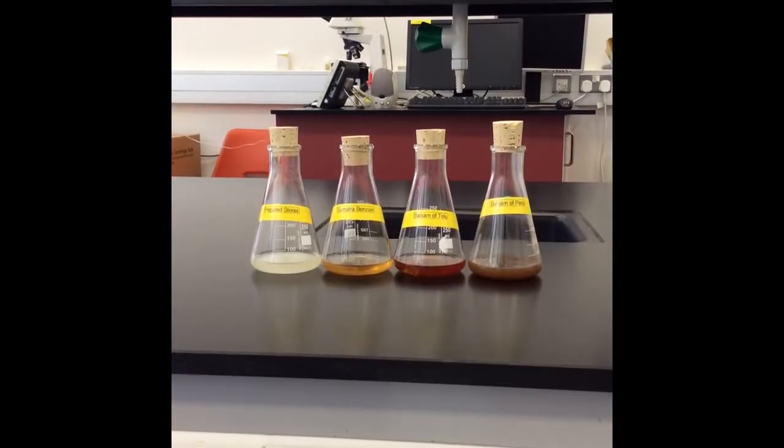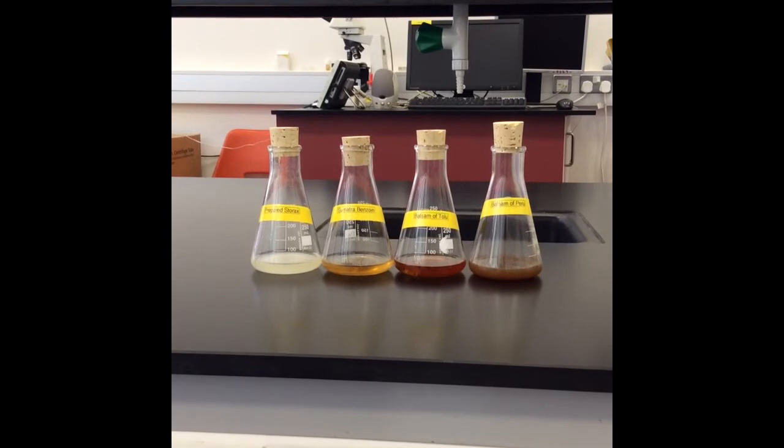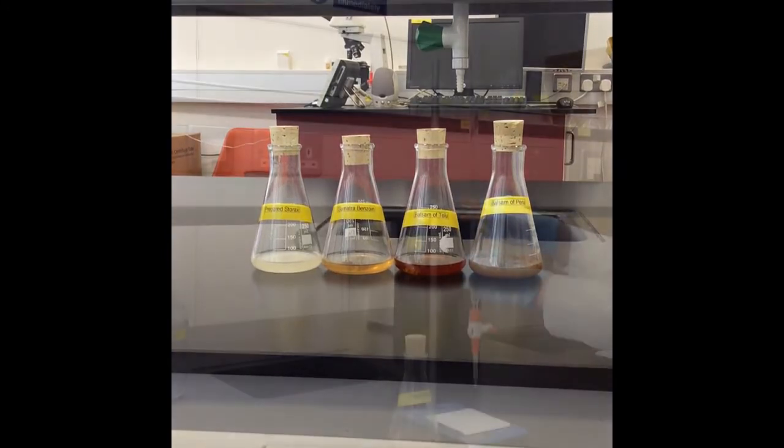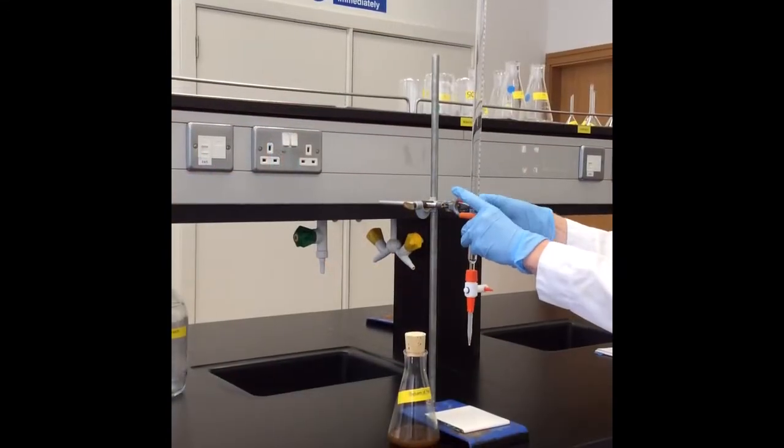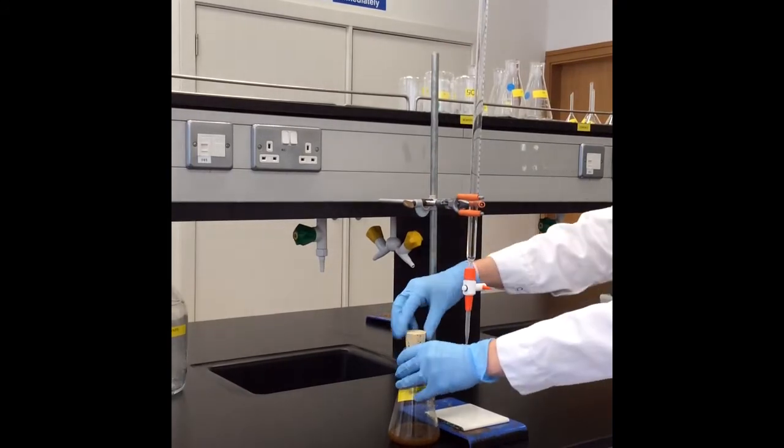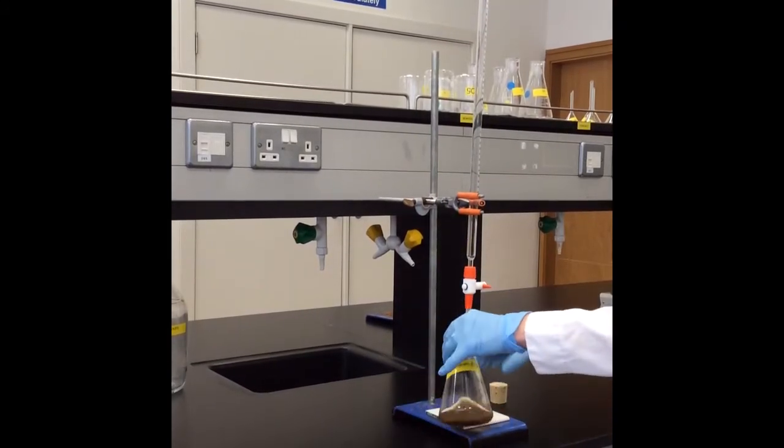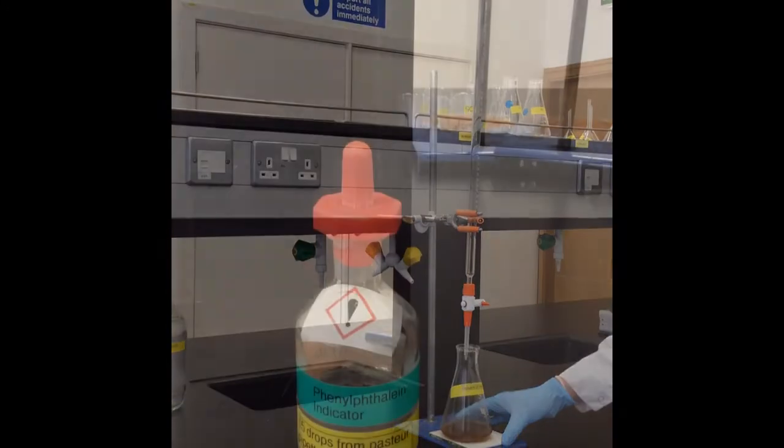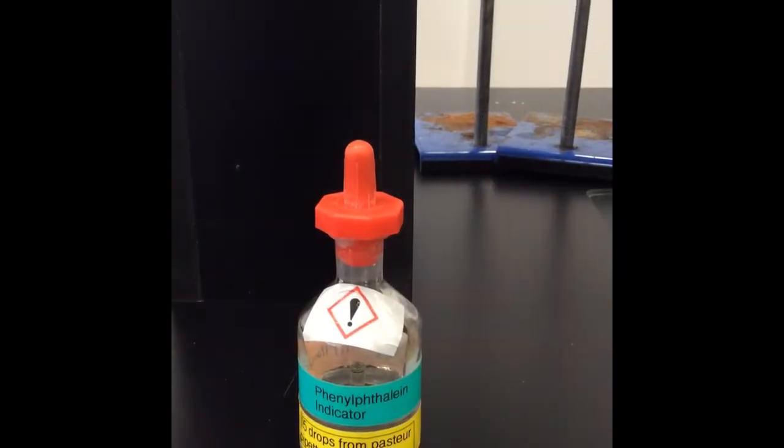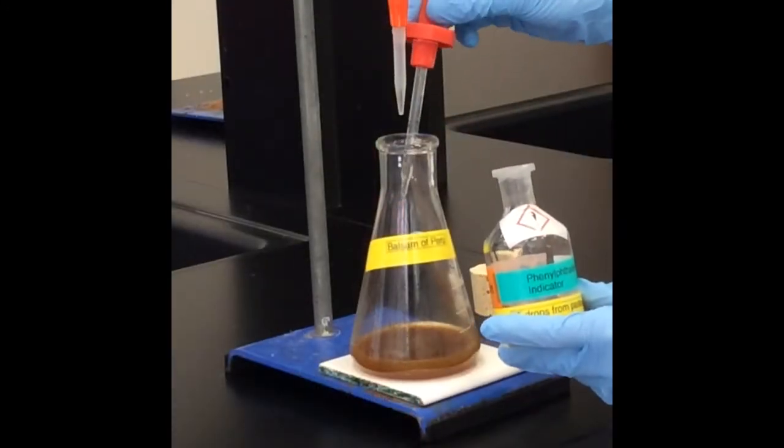One gram of each of the four balsams was dissolved in 50ml of methanol. Each of the four balsams were titrated against NaOH three times and the mean was calculated. A few drops of phenolphthalein was added as the base indicator.